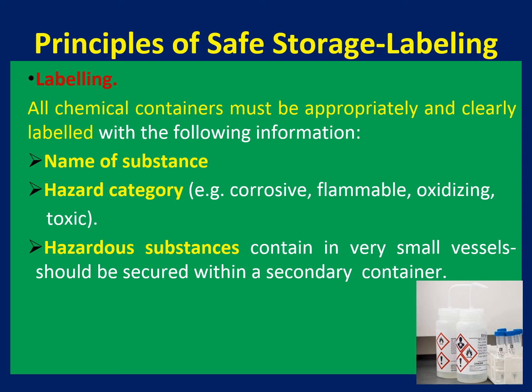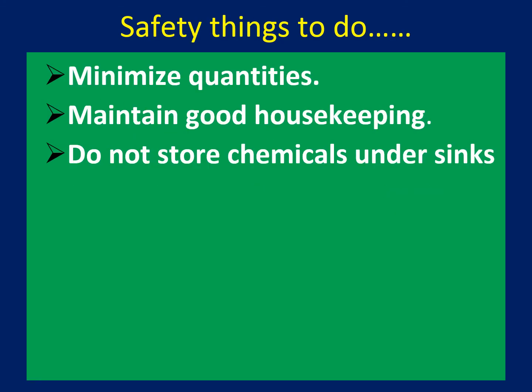So that's why we are always asking you to keep the labels on the chemicals, and if you can, put the hazard symbols on that label as well, and store those chemicals in the proper place. If you see a label going missing, like detached from the bottle, please paste it back in a proper way, because if the label is missing, we have so many chemicals inside the lab, so it is useless and cannot be used for the current experiment, or even for future experiments.